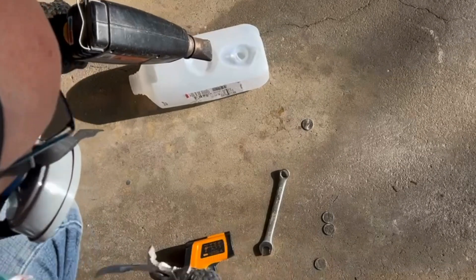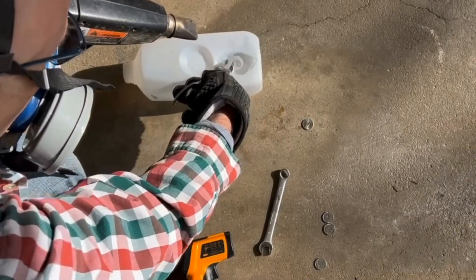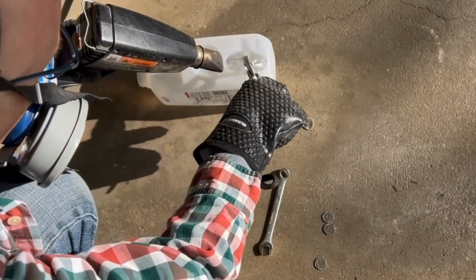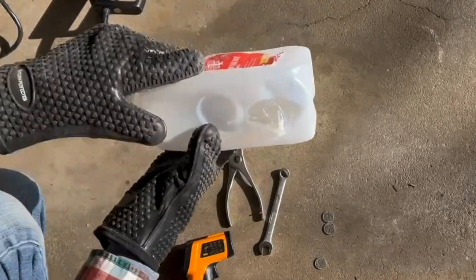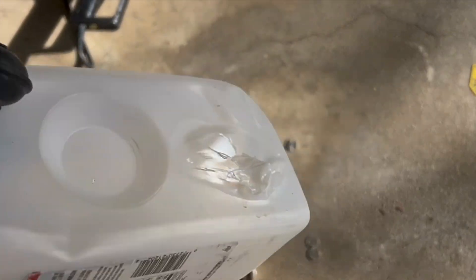That was successful, so now I'm going to try to pull on the plastic and reshape it using pliers. That also was successful. The plastic didn't give any evidence of undergoing a chemical reaction when heated, so I'm assuming this is a thermoplastic — something that is recyclable.